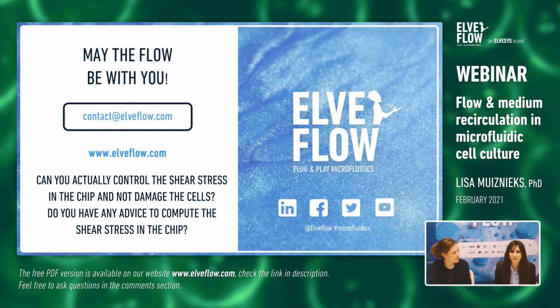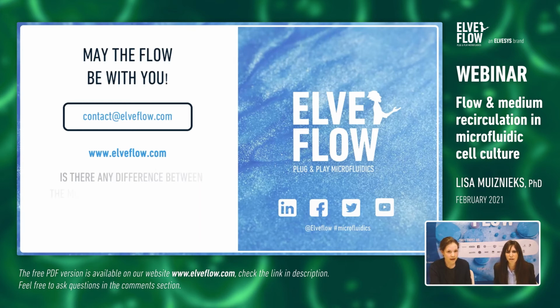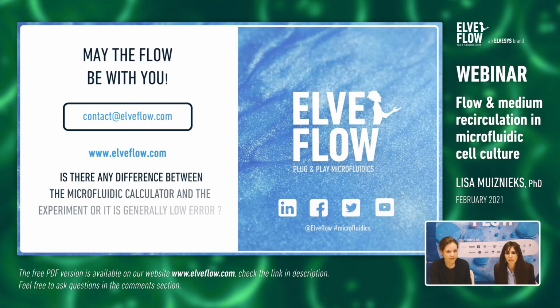Thanks, Lisa. Next question from Abbas: is there any difference between the microfluidic calculator and the experiment, or does it generally have low errors? Well, of course, it is an estimation that we give. It's there as a guide to give you a fairly close idea, but it won't be 100% precise. It really depends.